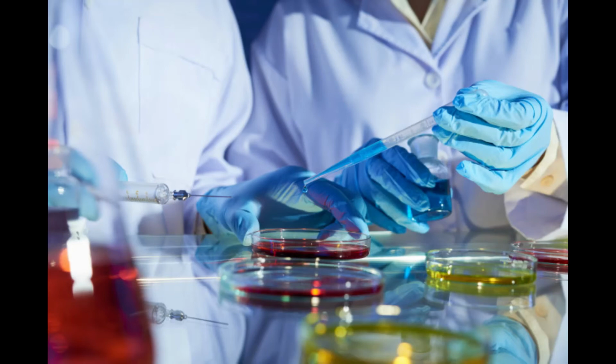You're going to do 3 stabs. So you don't re-dip in between stabs. You just dip once into your serratia. And then you're going to take this and do 3 different stabs down into the agar in 3 different spots. And that's it. You try not to touch anything. Flame everything, put the lid back on, and that one's all done.